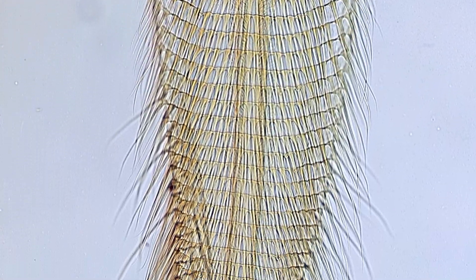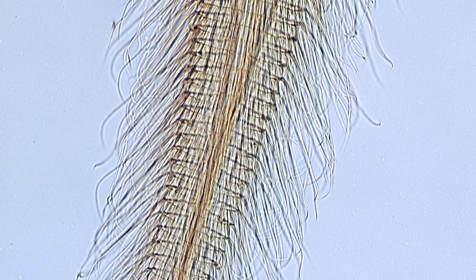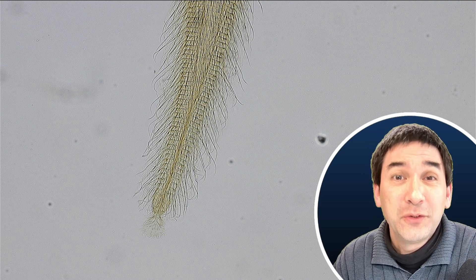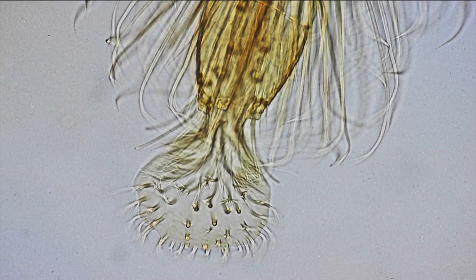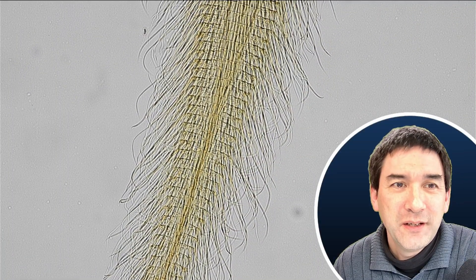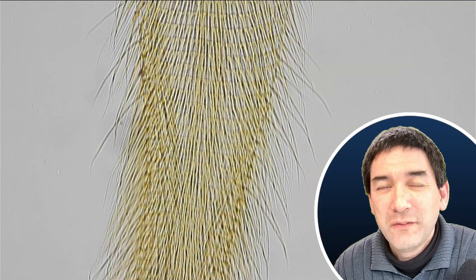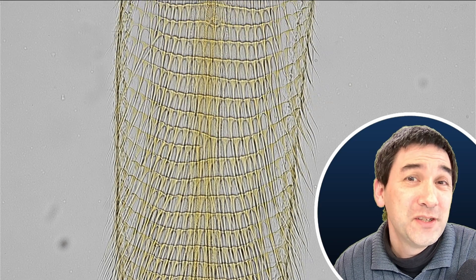The specimen has been properly bleached and prepared, so all of the details are nicely visible. It is a somewhat specific structure — there are thousands of tiny little hairs growing on here. We're looking at an animal or the part of an animal, not a microorganism. Let's go up again with the magnification. Quite visible are different segments, so I'm going to give you this information: we're looking at an arthropod here. The question is now, what is it exactly?